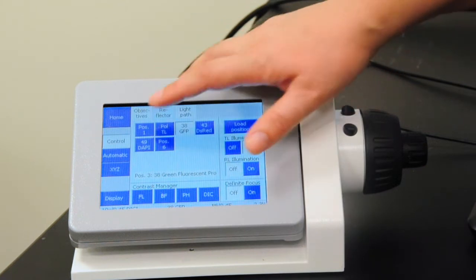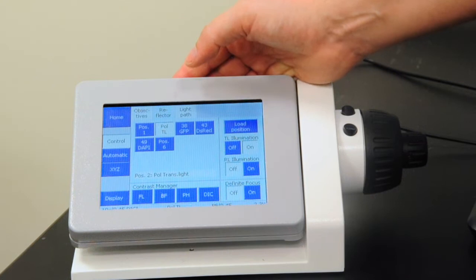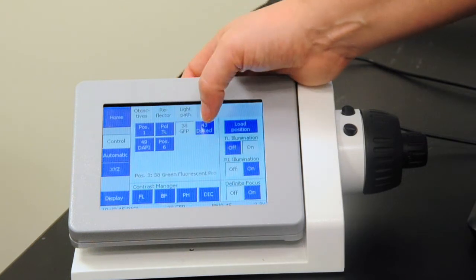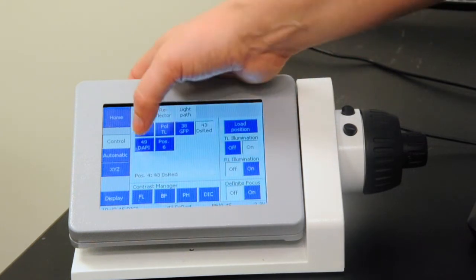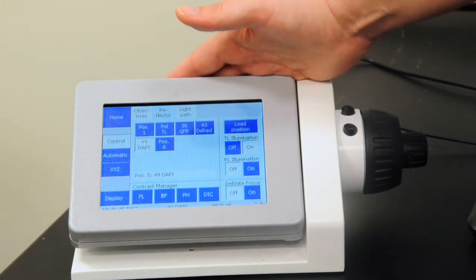Under this, we also have our reflectors. We have our polarizer for us to be able to look at our DIC. We have GFP, DSRED, and DAPI. Although we have the ability to image in far red, we do not have a far red cube because we're imaging through the PMT and humans cannot see in the far red channel.